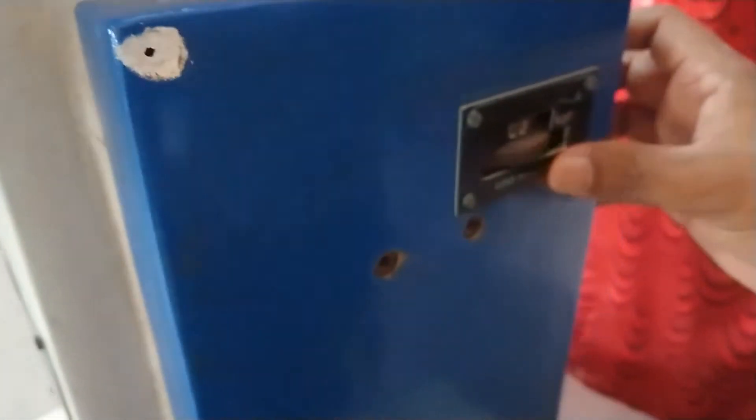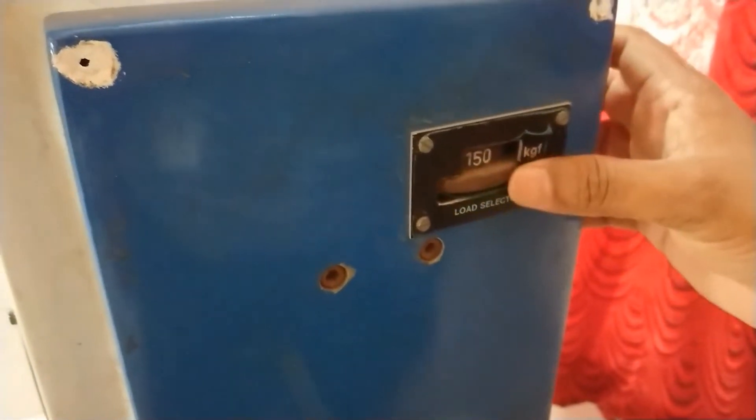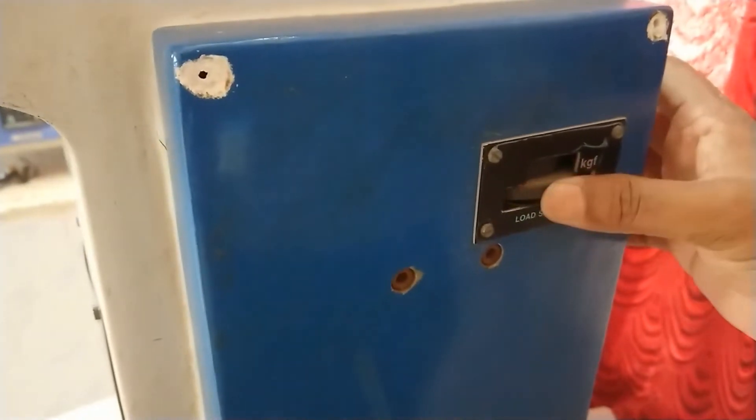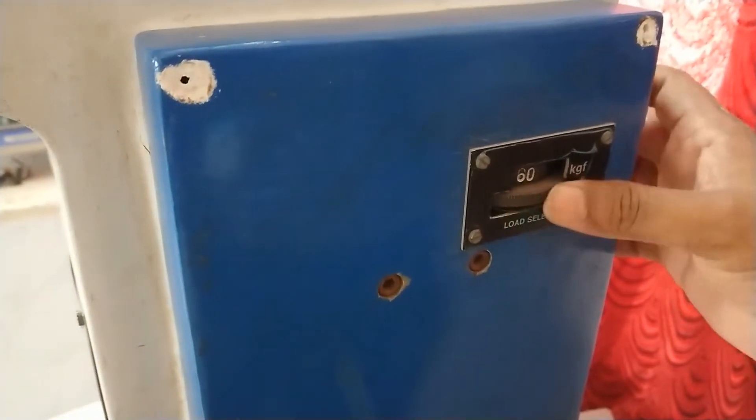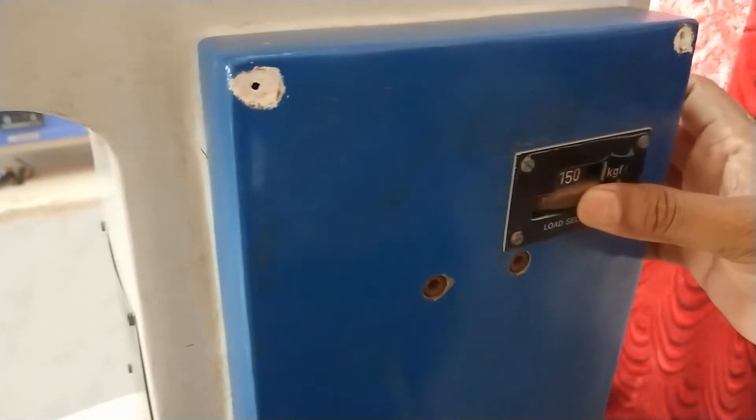This is the load setting area. You can rotate to set various loads. This setting is 150 kgf, this is 60 kgf, and this is 100 kgf. Now you have to apply 150 kgf.